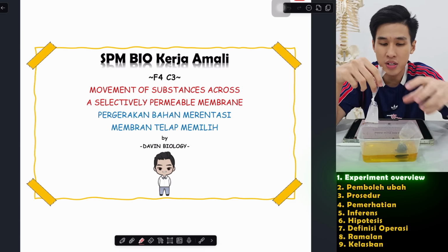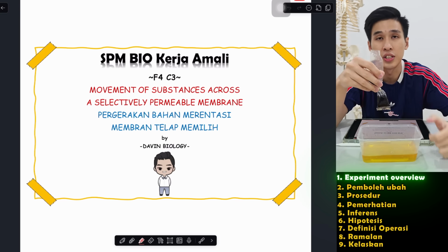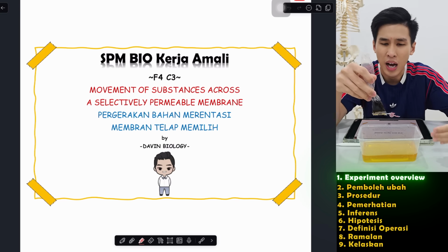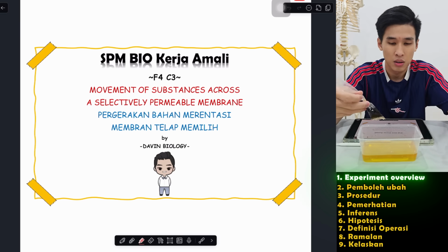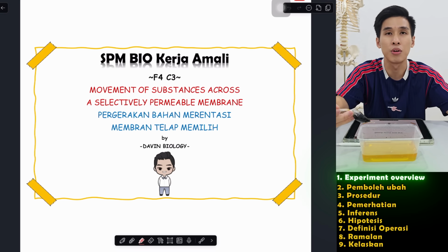Now why this is possible is because if I only got one Tiub Visking, put kanji inside, everybody knows the outcome. Iodine goes in, blue color. Which means I don't even need to do the experiment. I know the outcome already.